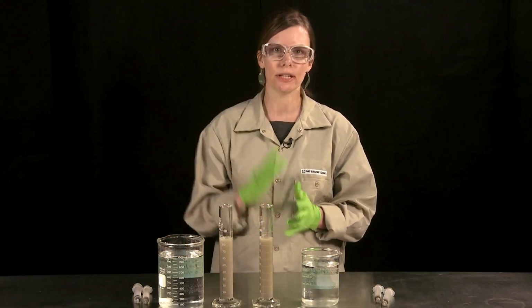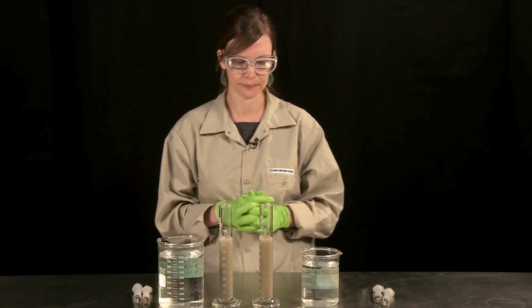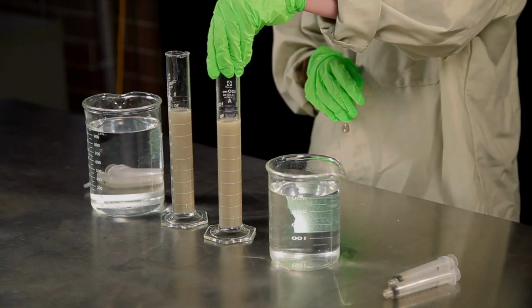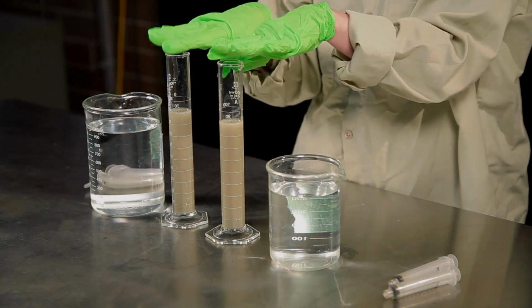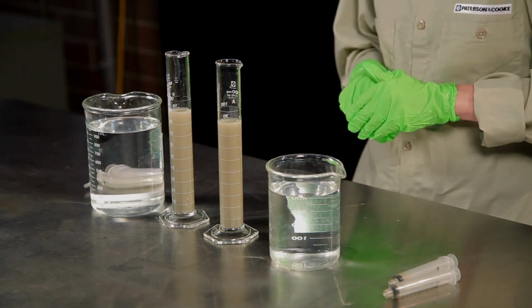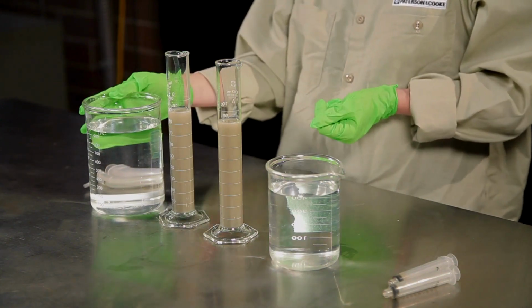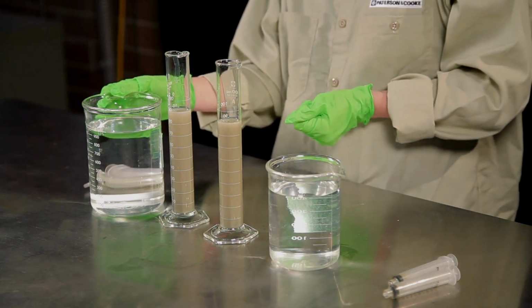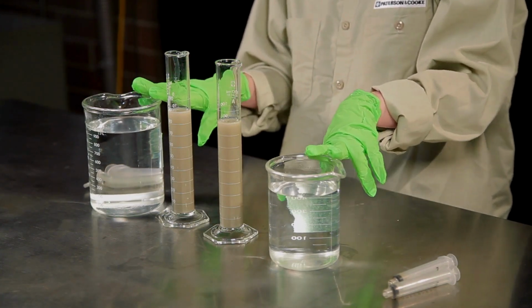Today I'm going to be showing you an example of coagulation and flocculation in a slurry sample. Here I have some samples of kimberlite which have been diluted to 1% solids mass concentration. The polymers we're going to be using today are flocculant Mg655 and coagulant MF368. These have been diluted to 0.025% by solids mass.